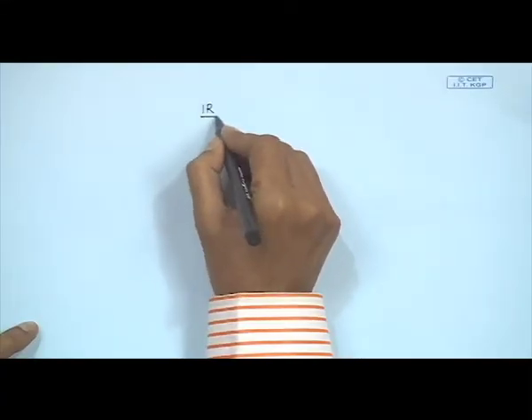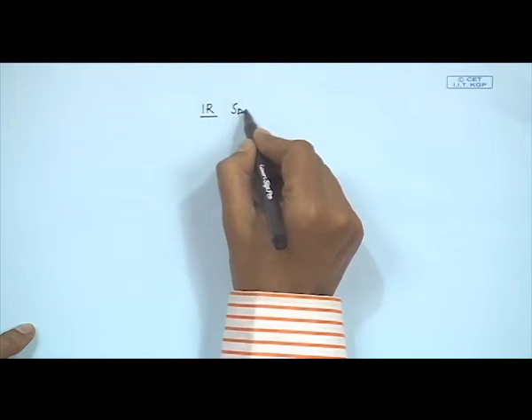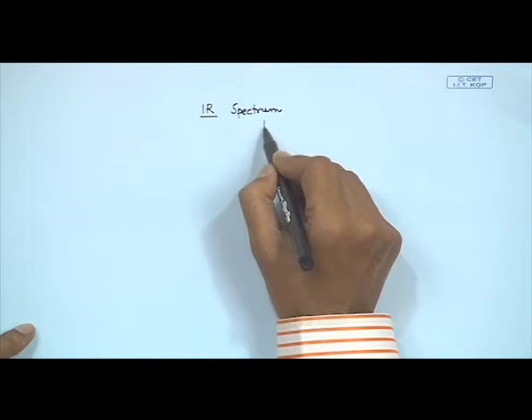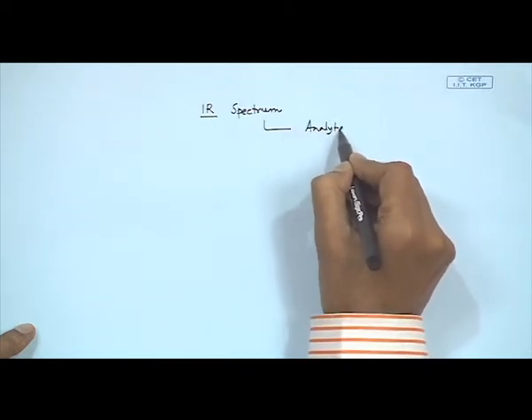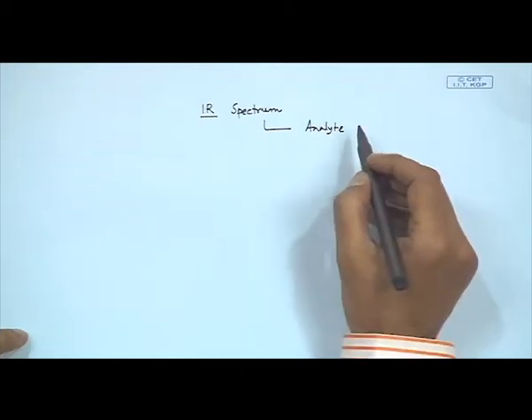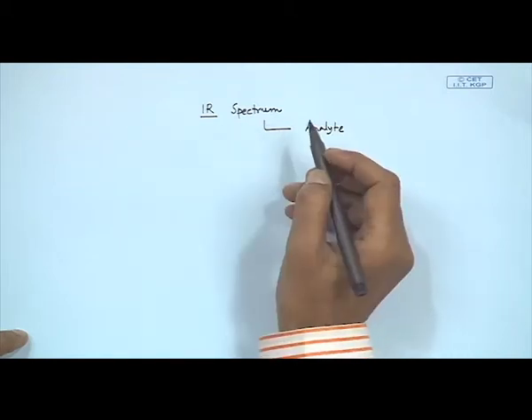Hello and welcome back to this class where we have started discussing IR spectroscopy, and we want to record the IR spectrum of any particular analyte which, like that of our UV-visible spectroscopy, can show the corresponding absorption in the IR region.